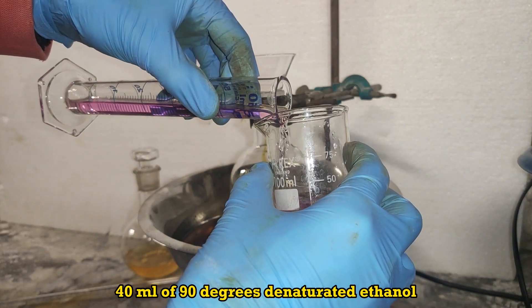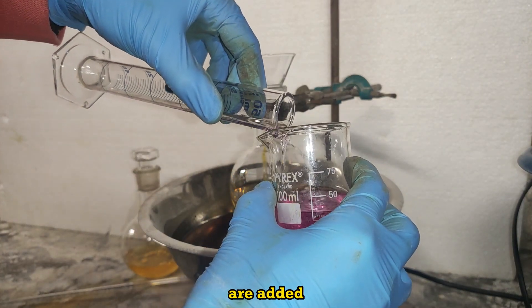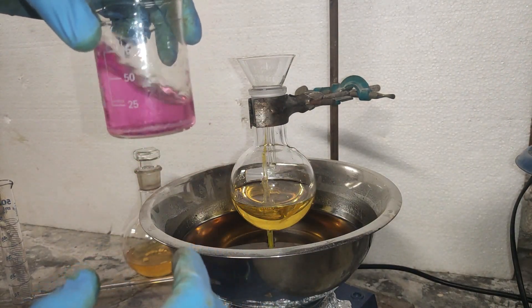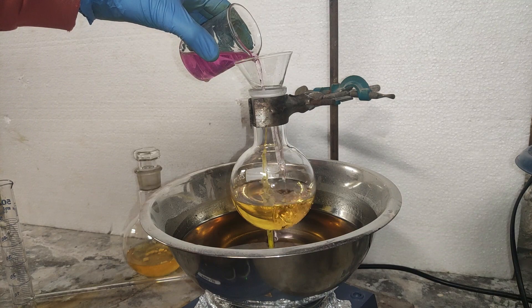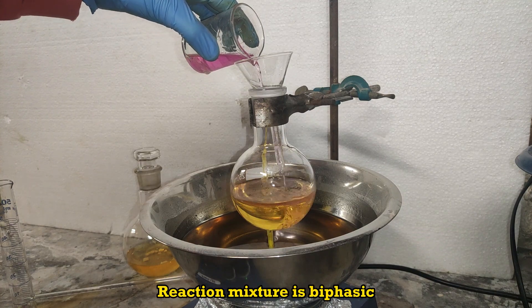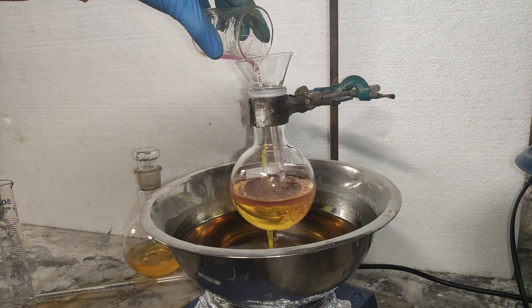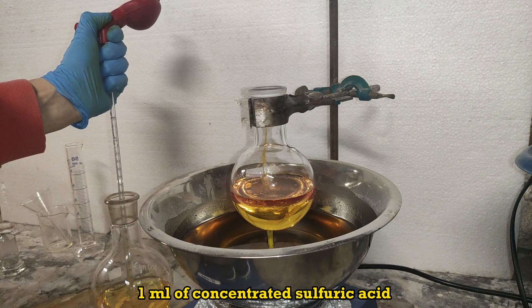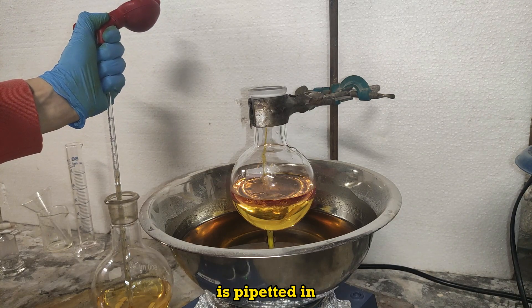40 milliliters of 90 degrees denatured ethanol are added. The reaction mixture is biphasic. 1 milliliter of concentrated sulfuric acid is pipetted in.